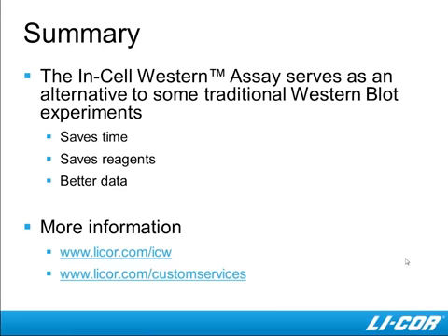If it doesn't state that it works with immunohistochemistry, you might want to contact the antibody vendor and see if they have more information regarding the primary antibody's ability to recognize native state versus denatured state proteins. Or if they don't know, or if it doesn't state it, perhaps you want to switch your primary antibody to a different primary antibody that will work with native state epitopes.